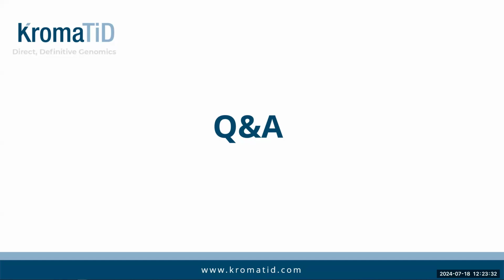And the answer to that actually would be, it sort of depends on the way the project is set up with the customer in advance. So for example, we can even do fully blinded analysis. You don't have to tell us which is your treated sample, which is your edited sample, until we get to the point where you actually want a statistical comparison, and then there needs to be an unblinding. But we can give you all of the data up front for individual genomic reports, and then unblind it after that and apply the analysis. So we're happy to be tested in that fashion.